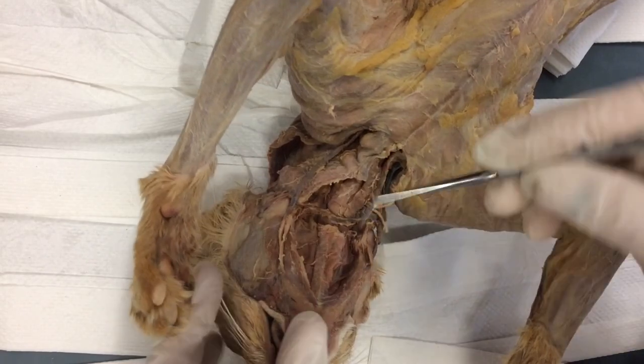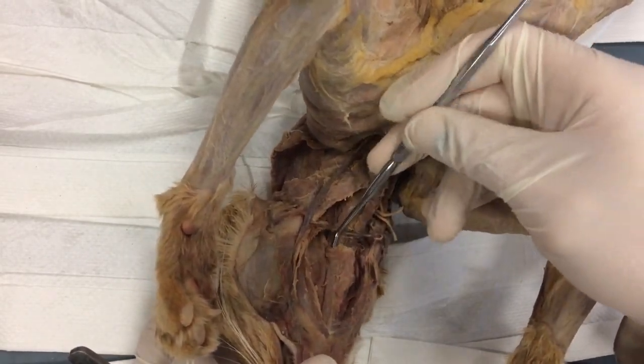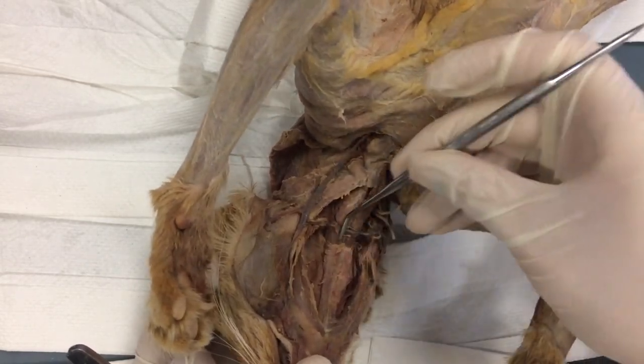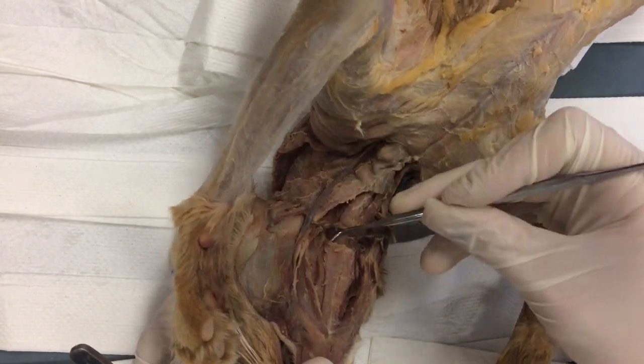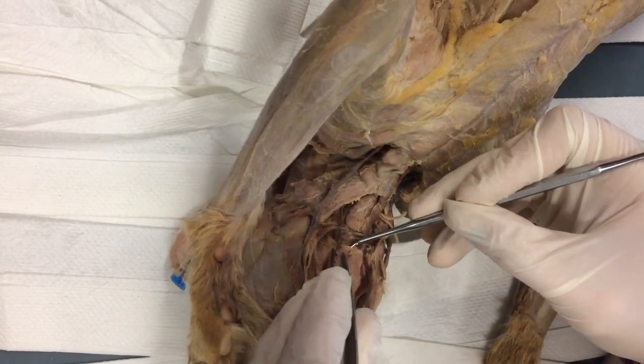Okay, now I got that started. Watch. I'm going to go to the other side. What technique is this? This is the wiggle. So I'm just going on the other side of that seam, and I'm going to wiggle this free using the back side of the probe. If I have to, I'm going to come in with my forceps and support.